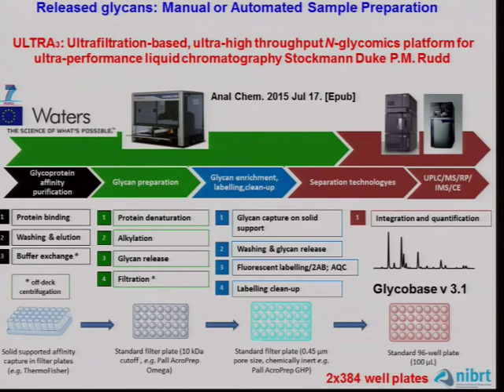Purify your glycoprotein, because sample preparation is really critical. If you don't get it pure, then you've got other glycoproteins in the mixture and you'll get skewed results. So that's very important. Then release the glycans, making sure you've released them all, because if you don't use enough PNGase F, for example, if you dilute it out and out and out, in the end the fucosylated structures will not be released.